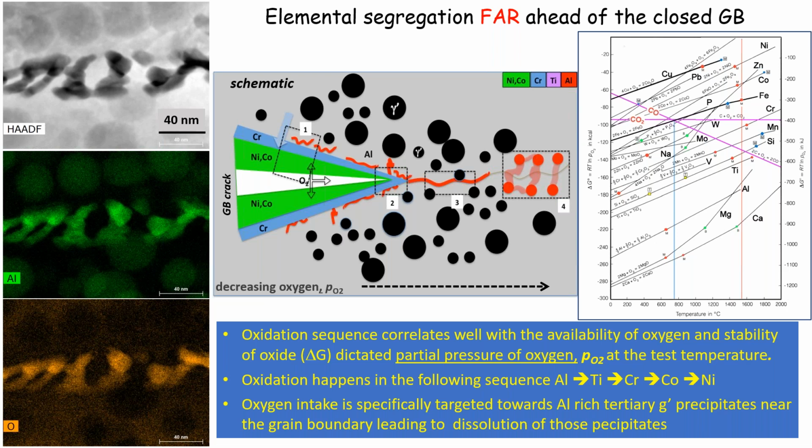But it has a very simple explanation. People who have done some chemistry and physics would know that the oxidation kinetics of an element depends on the partial pressure.